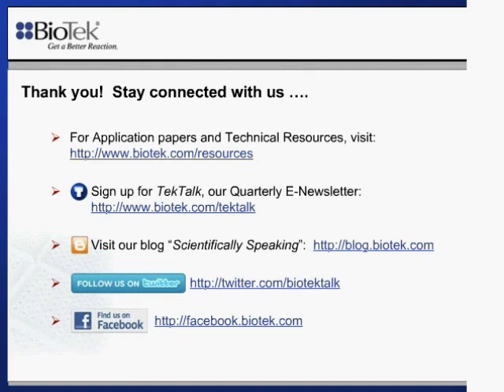Next question is, the concentration I usually have is around 1 microgram per microliter, assessed by Bradford method using Epoch. Is it too little to quantify using Take3, considering the noise of RIPA? I'm not sure about that. It would depend on the RIPA buffer. I haven't used that here, so that's a good question. It's worth a try. I would certainly give it a try and see if you can get accurate determinations, as compared to your Bradford method. And certainly that could save you some time if it does work, but we have not tried that here.